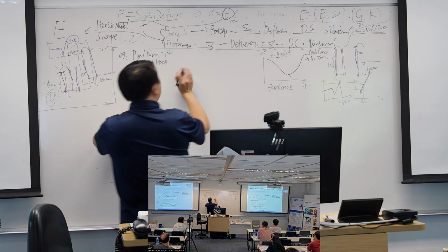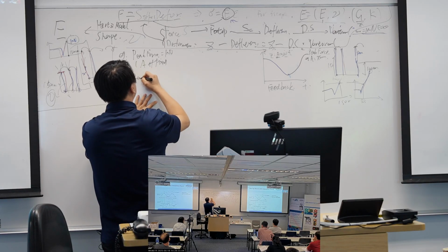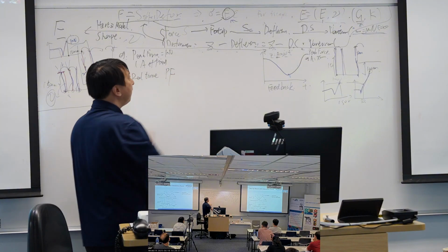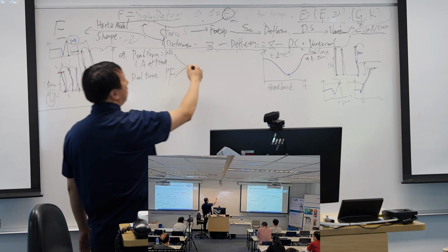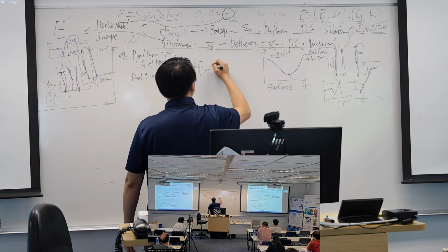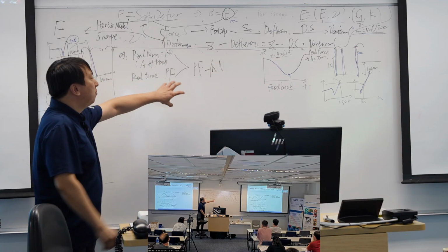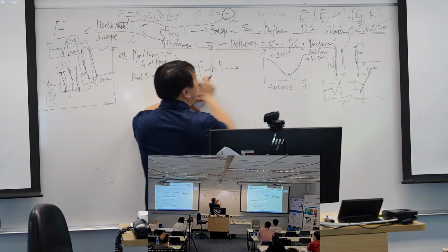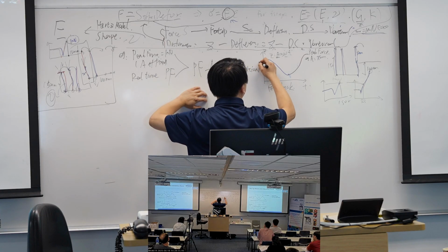And then I will capture the real-time peak force. I again take the difference with the setpoint. From this difference, I will define the position of my tip.